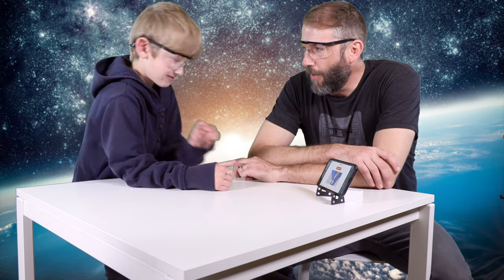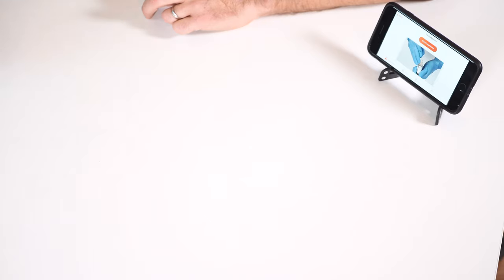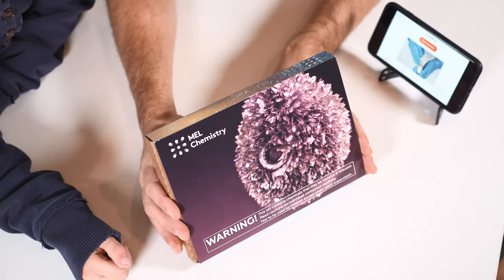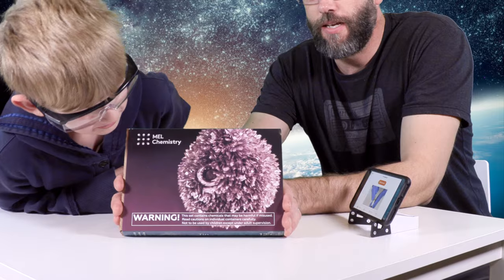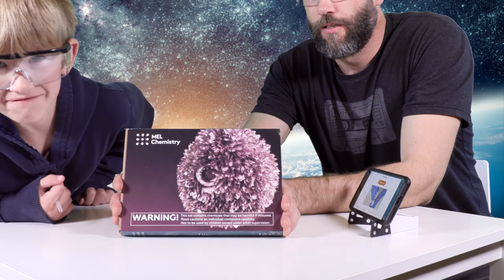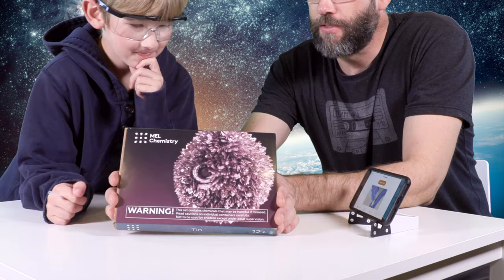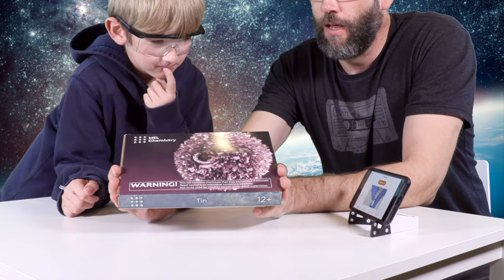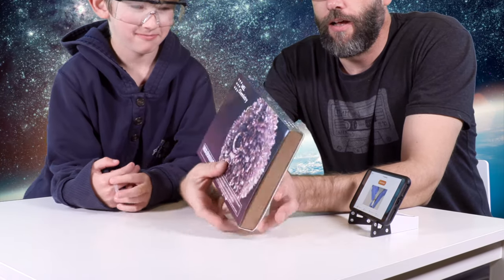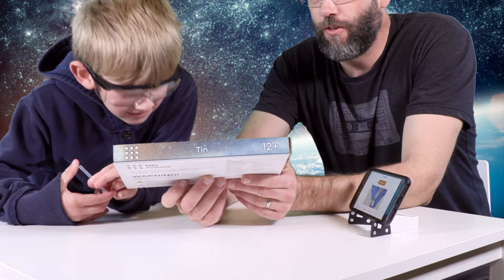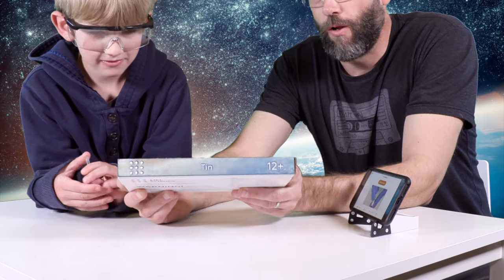What are we going to do today, bud? Tin. So what have we got here? This is the Tin Experiment. It has at least four warnings. Yes, it's got many warnings. This is the Tin Experiment from M.E.L. Chemistry. It's also 12 plus. And it's for people who are 12 plus. How old are you? Eight. I'm 42 so together we're well over 12.